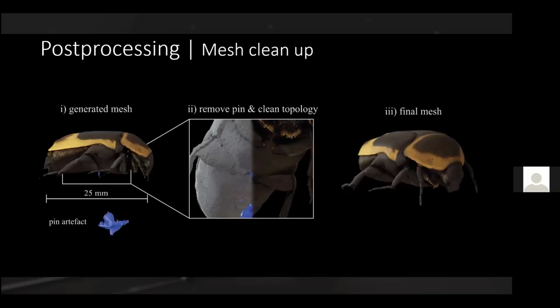Before I talk about that, we do a few post-processing steps, although strictly none of these are necessary depending on the model quality that you're after. Most of the insects that we scan are pinned, so we can remove pinning artifacts, which you see here in the bottom. This is a manual step, so we haven't automated this. It takes, therefore, a period of time, depending on how experienced users are with software such as Blender, but it's possible, and you can remove it. You will still, with a keen eye, see where the pin was, so it's, of course, not possible to perfectly model what would have been there if the pin wasn't there, but you can close these surfaces and have them of similar appearance.